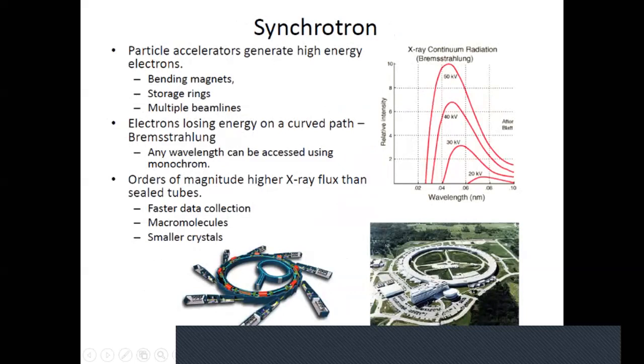Nowadays, though, there are certain national labs that use what's called synchrotron sources. And synchrotron is like a rocket ship compared to a Ferrari. Ferrari was the newest top of the line diffractometer you can have in your lab. But synchrotron is like a rocket ship. So it's going to be more powerful, it's going to be faster than anything that you can have in the lab. And you have to submit these to national labs for data collection.